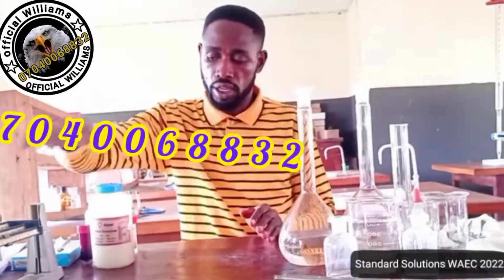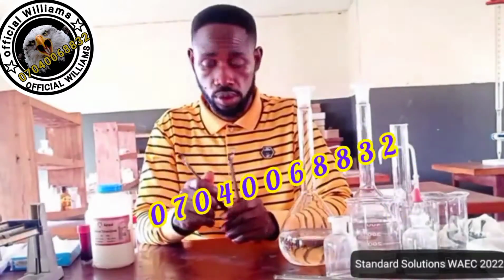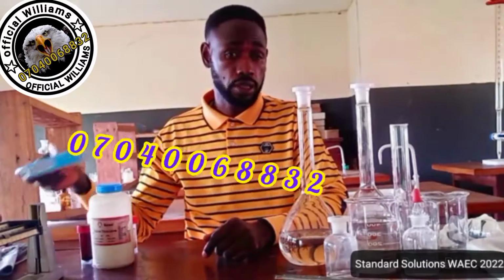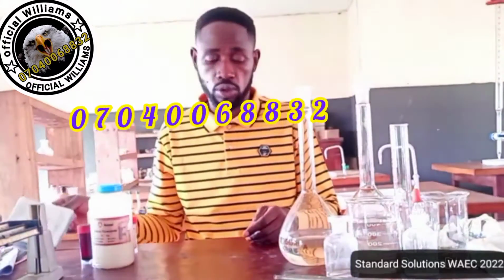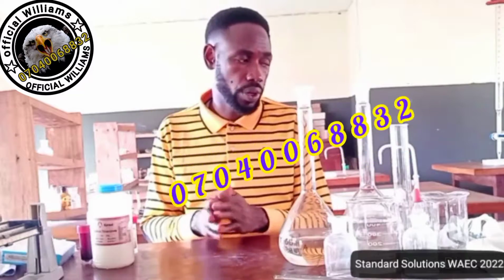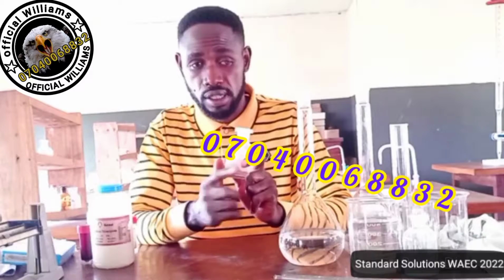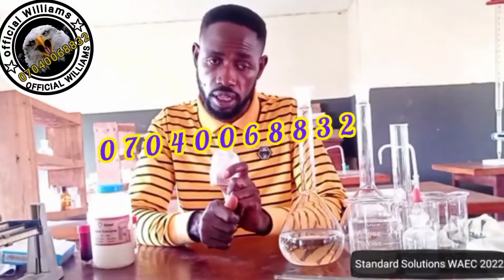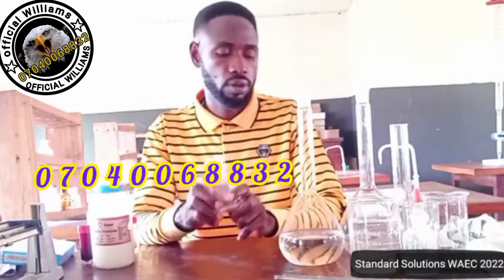Then you need your weighing balance, very necessary. Then you have your spatula too. Then you might need filter paper just for weighing as a container as you weigh these things. But remember to note the weight of the filter paper in your weighing. Then I have a small reagent bottle for 150 cm cube. So if I have 10 students, I will provide about 10 of them according to the specification. So if I have 100 students, I require at least 100 of these.